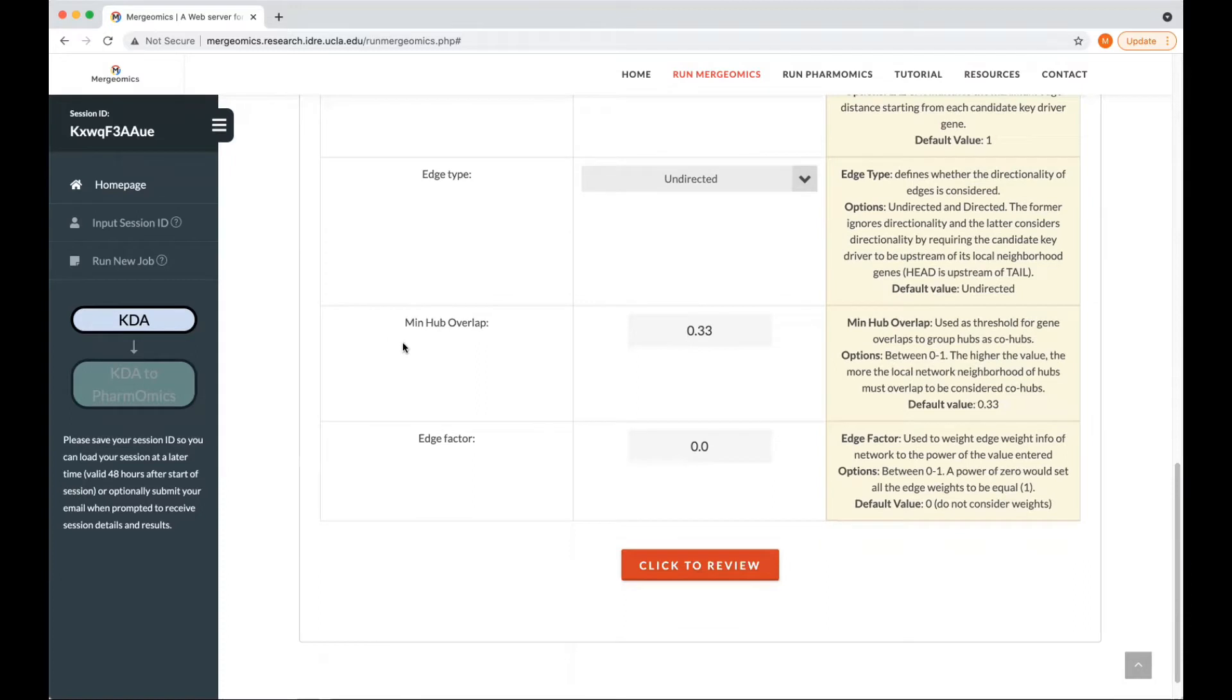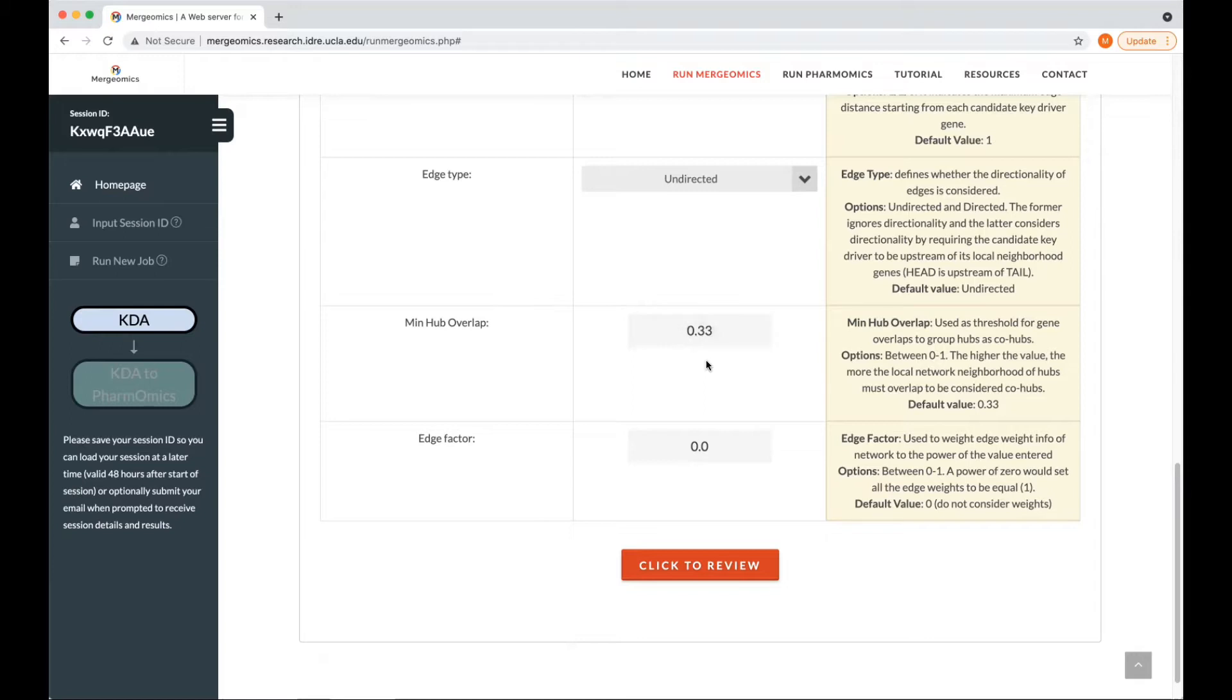Next is the min hub overlap, which is the ratio threshold above which hubs will be considered co-hubs. And we just recommend to utilize the default of 0.33 here.